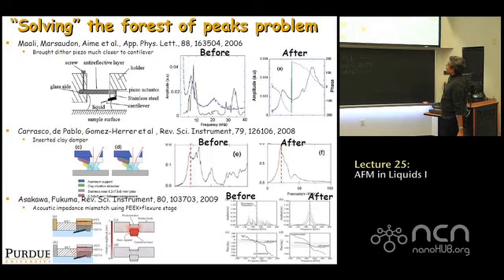And of course, Fukuma's group went even deeper and effectively redesigned this holder based on a full finite element analysis of the acoustic impedances of these different components. And they said that it's not a question of having the right damping material. If you just get the impedances properly sorted out, then you can sort of shake only the base of the cantilever and not shake too many other things in between. So, they also got some sort of an improvement in the forest of peaks. Okay, so you see the before, afters.